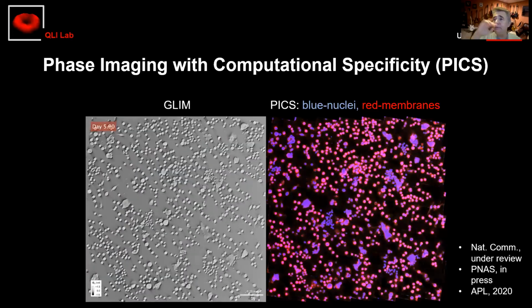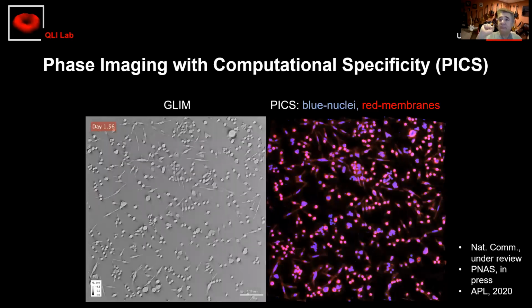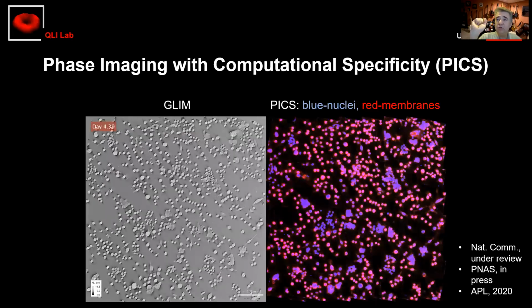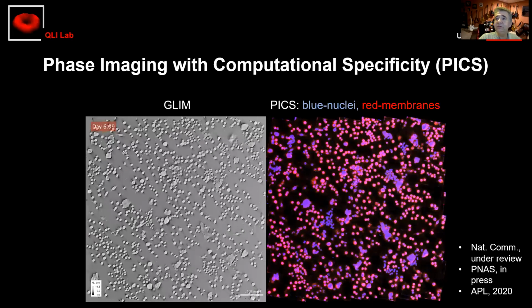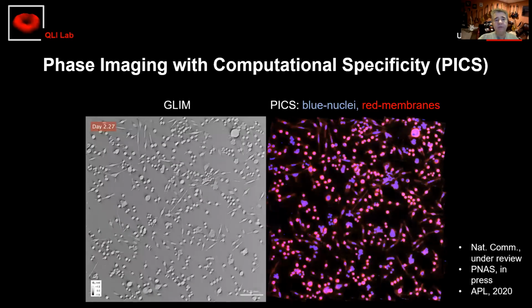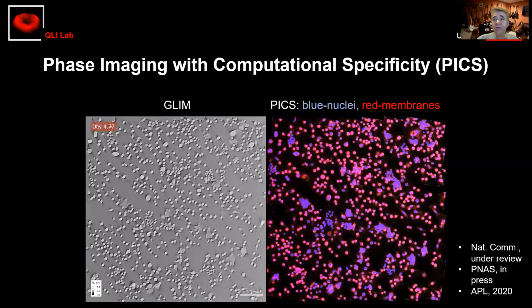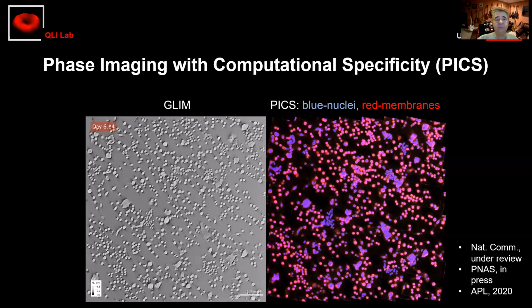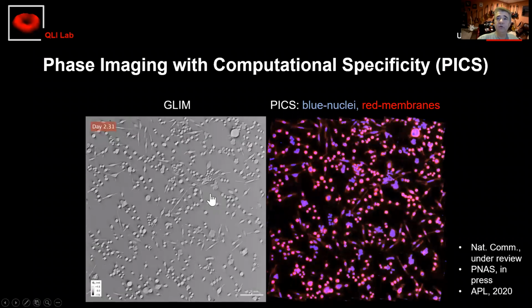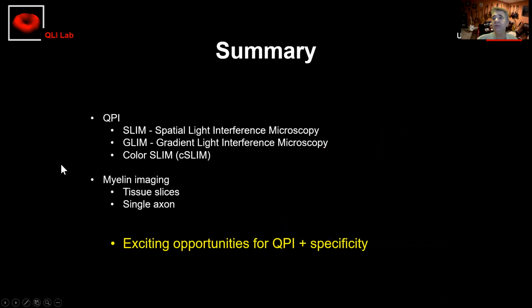So basically, this is a new direction for phase imaging, I think, because you really have an ideal combination now: non-destructiveness, no interference with the function of the cells, but now you get the specificity through the computation, provided that you can feed this data, ground truth, to the computer. And we have that ability because we build the instruments such that they share the path with fluorescence perfectly. So in a way, there is no manual annotation, actually. The training can be done automatically.